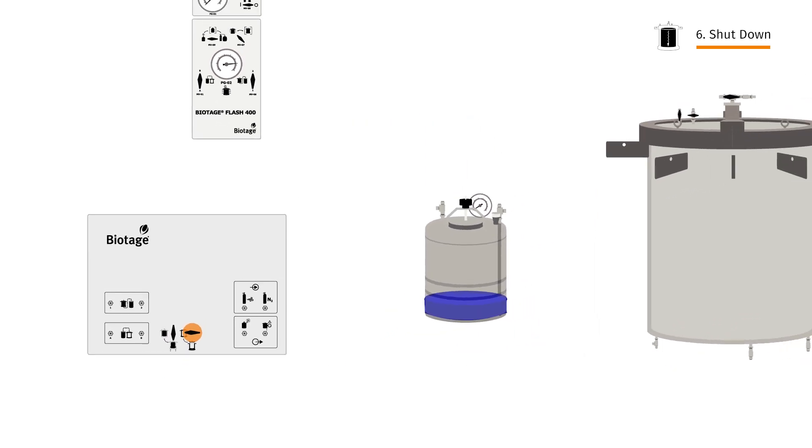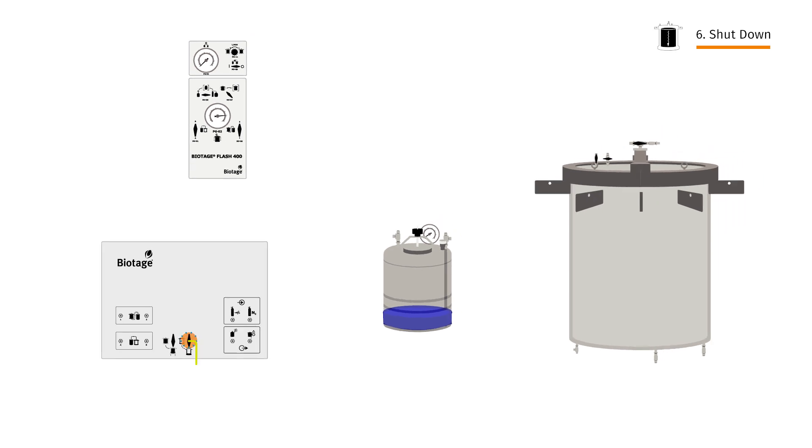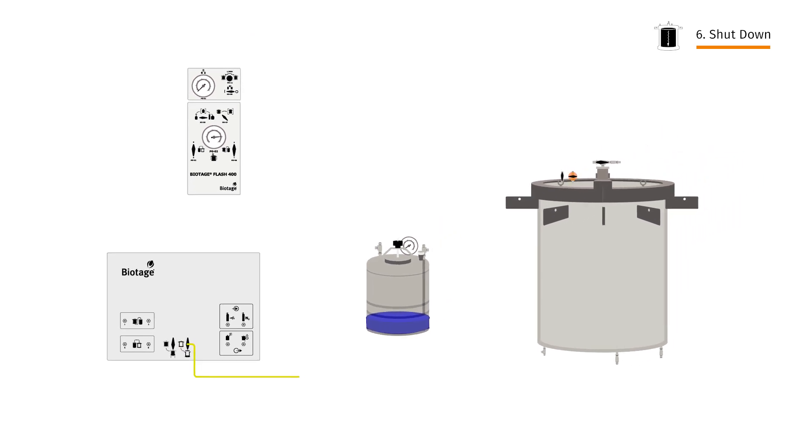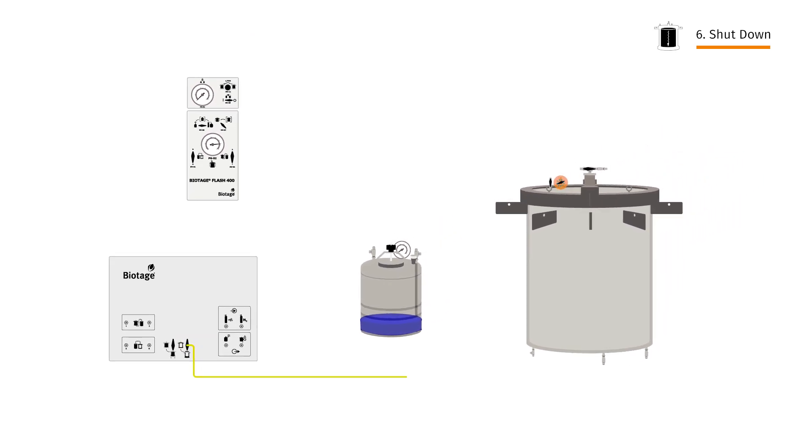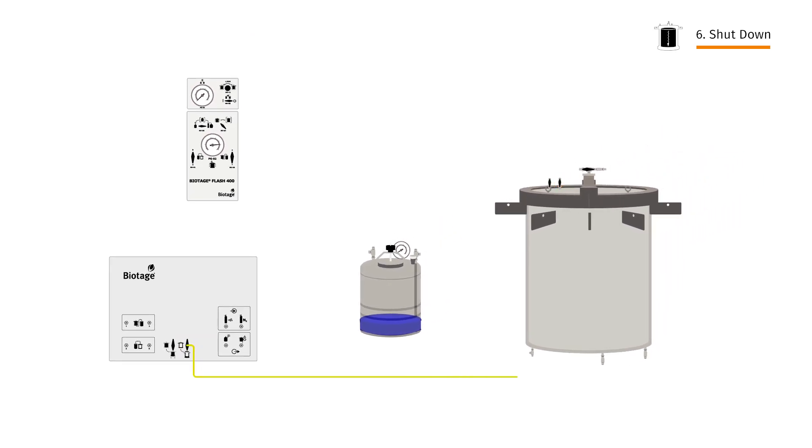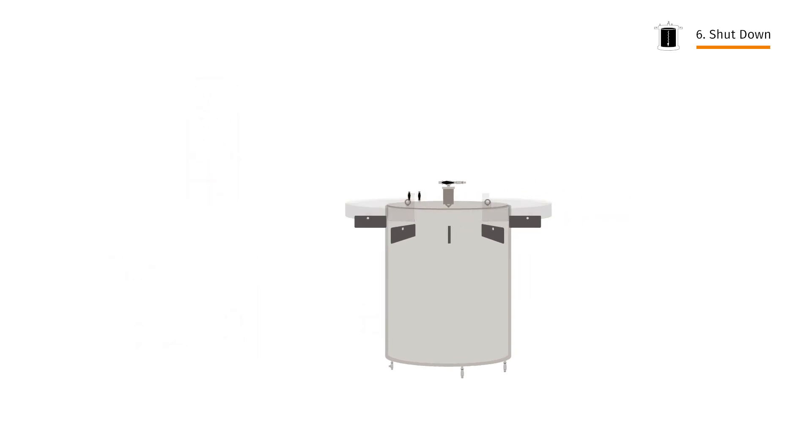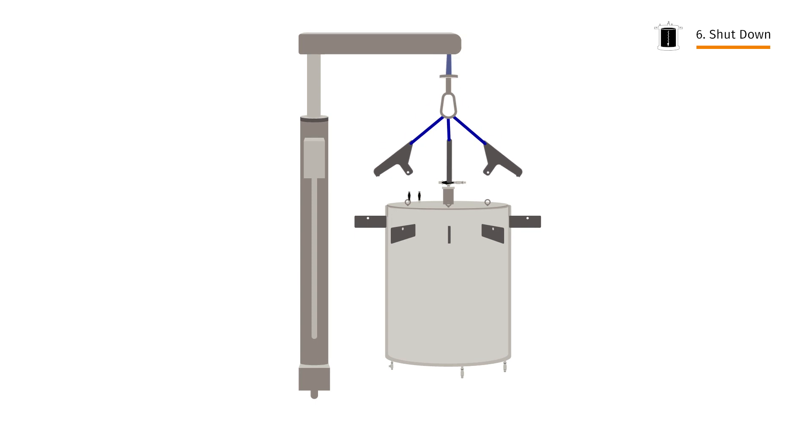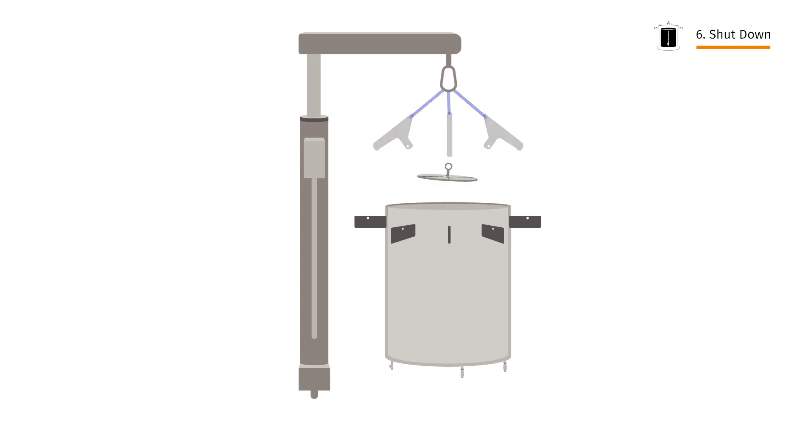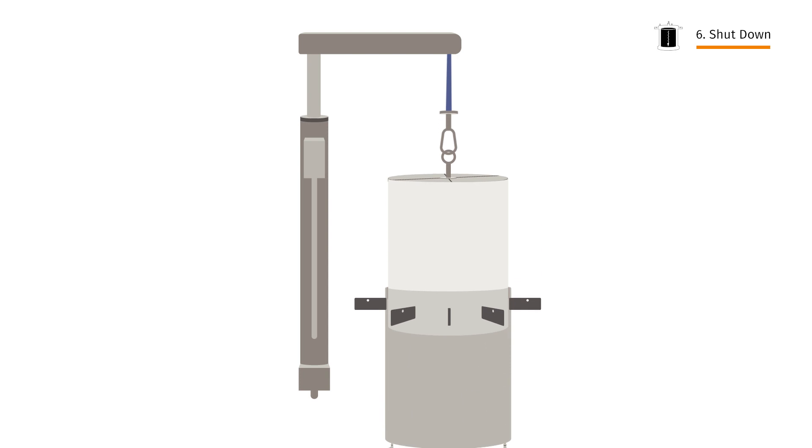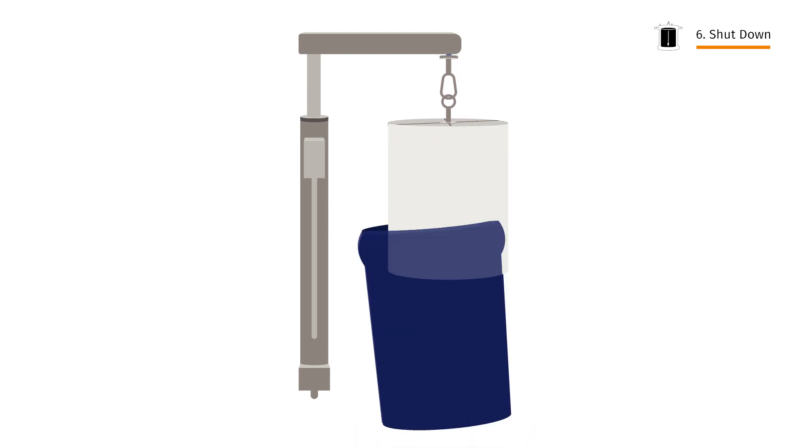Next, open the vacuum brake valves on the side panel and compression module head. Ensure that the inner pressure has reached zero. Remove the retaining clamps and lift the head off with the hoist. Then mount the cartridge tool on the used cartridge and hoist it back into the shipping drum.